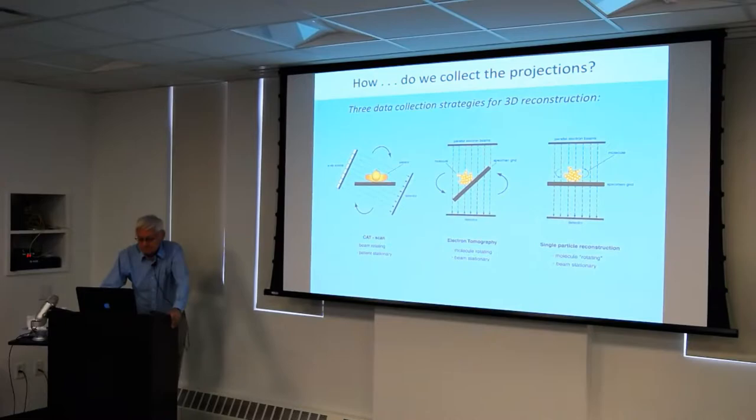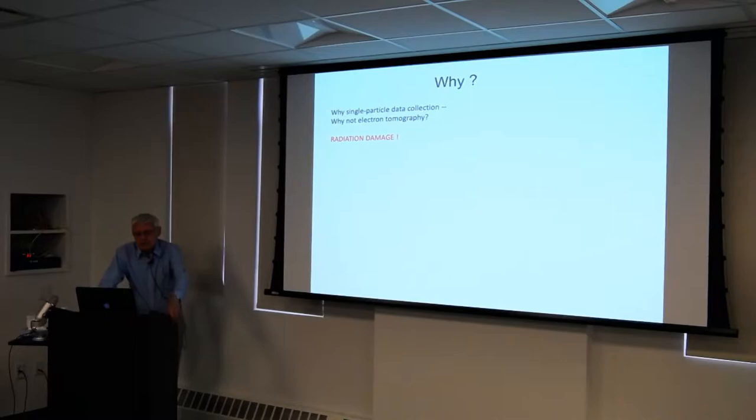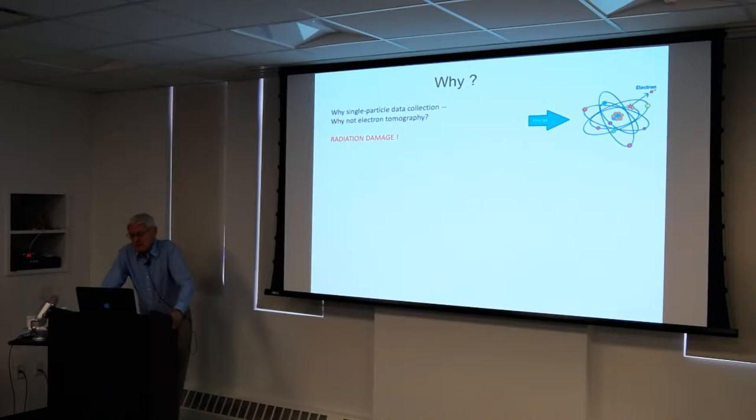So I already told you. The reason why single particle data collection is so much superior is radiation damage. And you know, when you impinge with radiation of any energy on the atom, then we get ionization events, and we get free radicals and so forth.